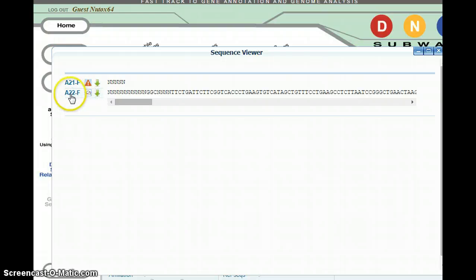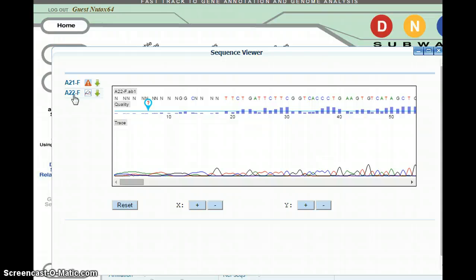To view your sequences, you go ahead and click over on the blue link to open up what's called an electropherogram. This is where it's super important to understand the terms that I just pointed out to you in the DNA word glossary, which is in step 7.